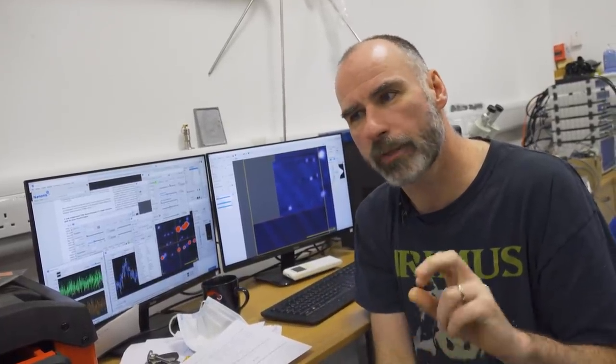Turn that idea on its head, and perhaps use piezos that are a little bit higher quality than those you get in barbecue lighters. If you apply a voltage to the piezoelectric crystal, it will distort. And if you've got good low noise high voltage amplifiers, and good crystals, then you can control the position of the tip down to the picometer level. That's a hundredth of the diameter of an atom.